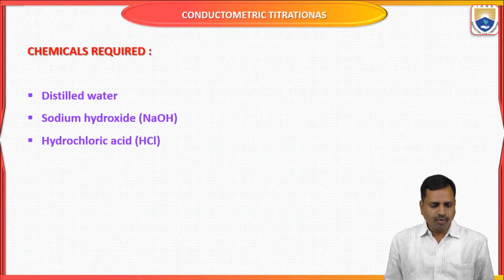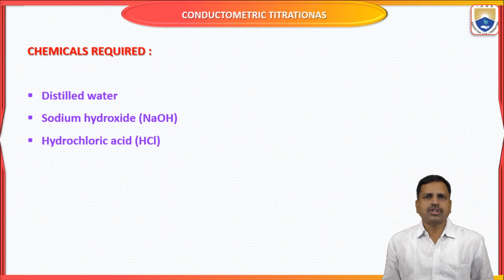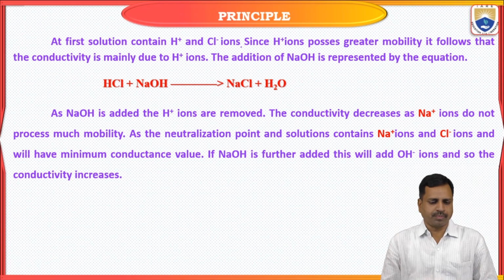Okay, so moving to the principle. At first, the solution contains H plus ions and Cl minus ions.